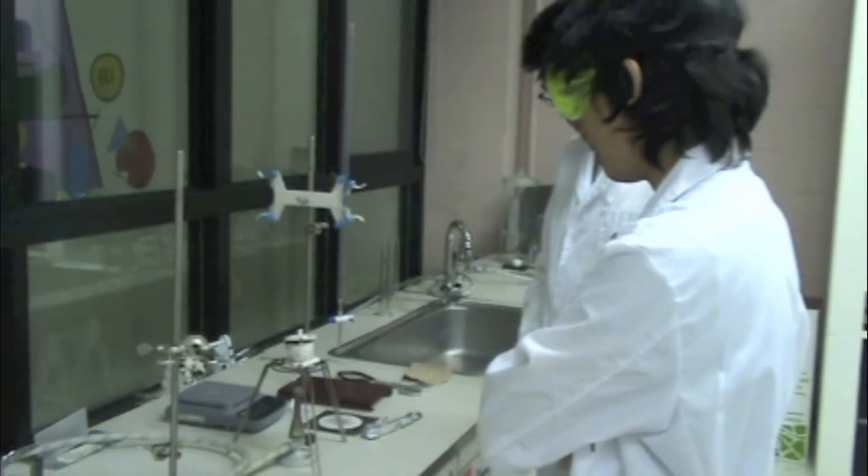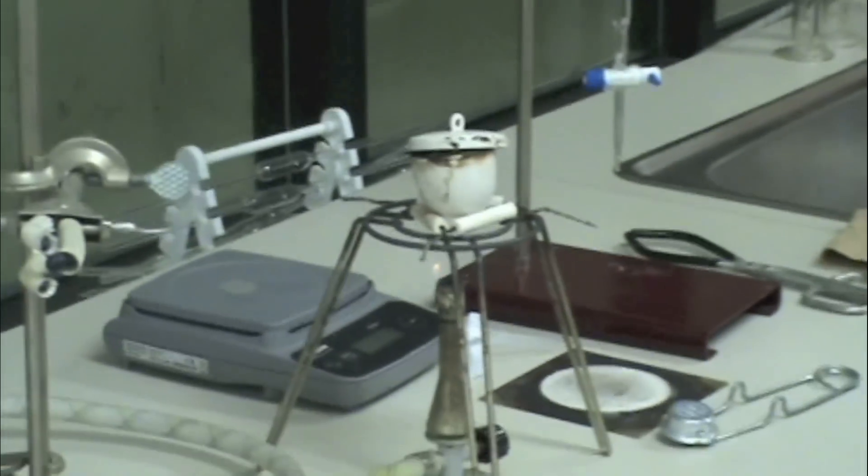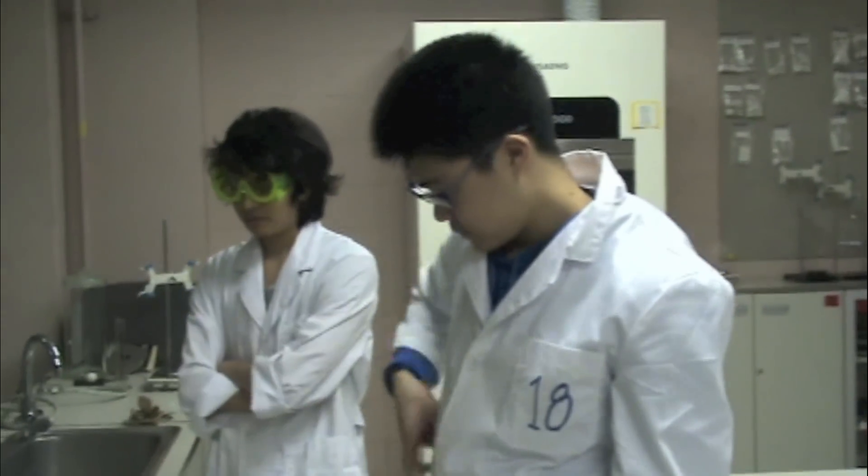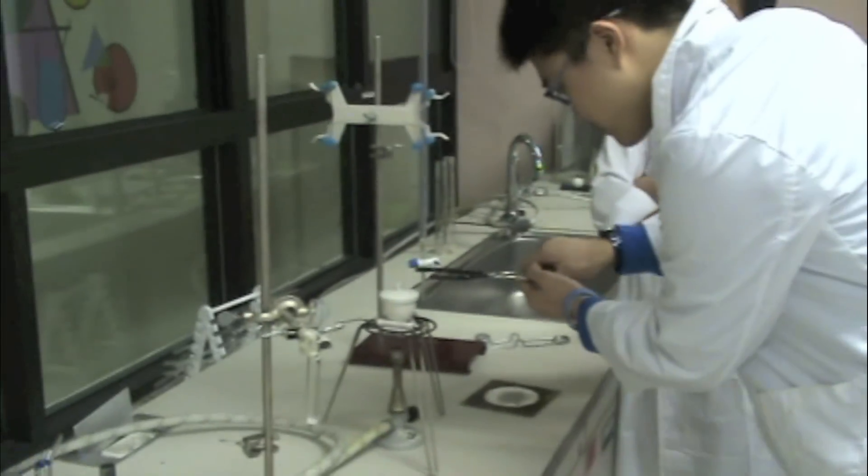So Billy, try to put the crucible on the wire gauze. No Billy, you can't grab hot crucibles with your bare hands. You need to use crucible tongs so that you don't get nasty burns on your fingers.